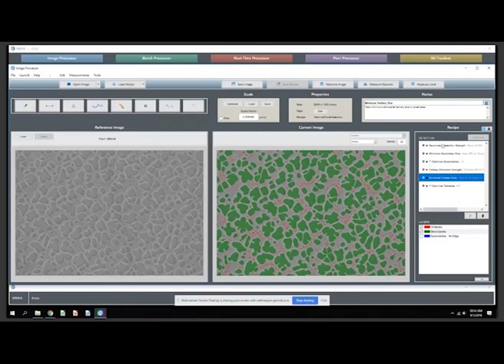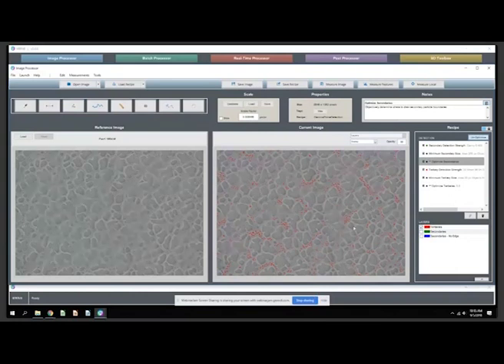But with simple mode now, the majority of our users see a very clean, simplified presentation of the key knobs that you might need to turn on this, named in friendly non-image analysis jargon ways. You can hide layers, of course. So the red here are our refined precipitates. The green here are the coarser ones.